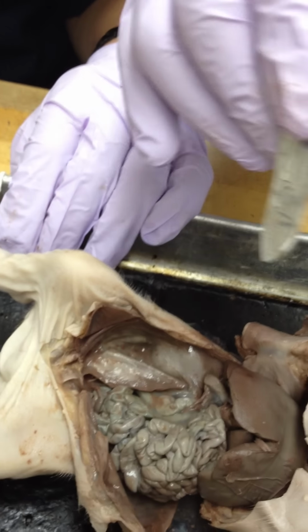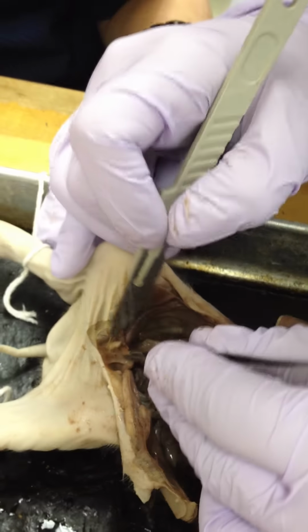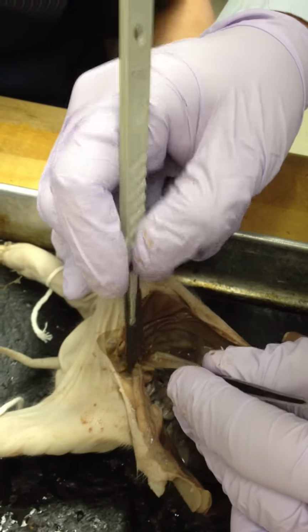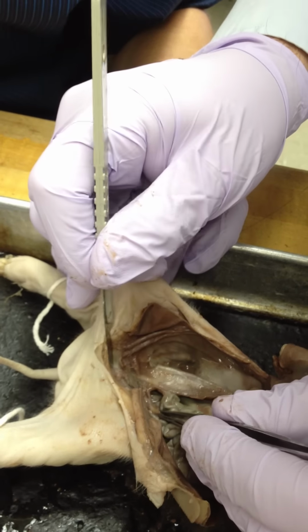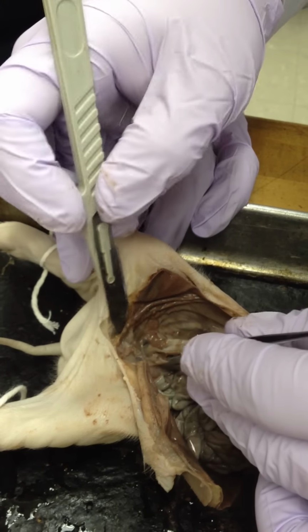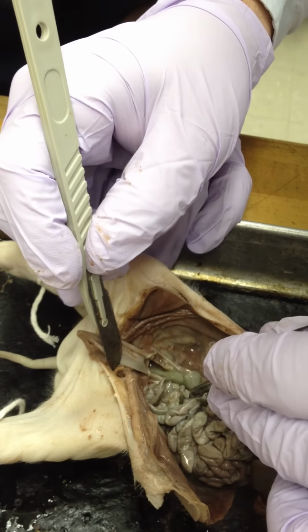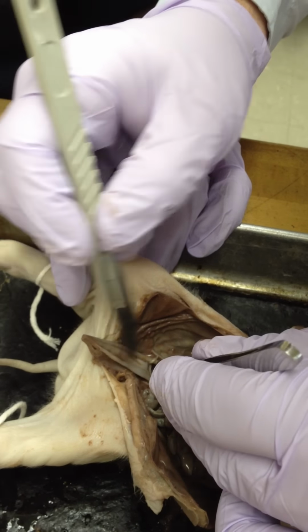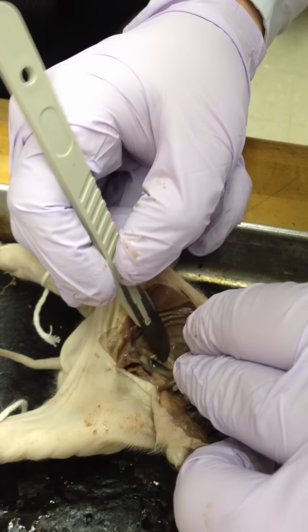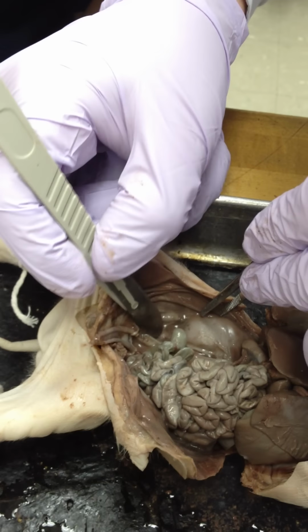Okay, thank you. This thing must have been connected. Damn it, it's hard to know where it's connected after it's cut. I think it must have been connected right there, down here. It has to be.